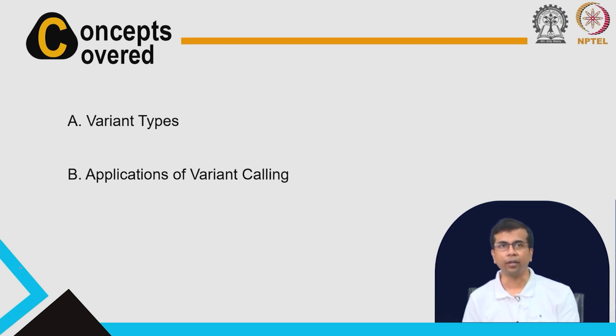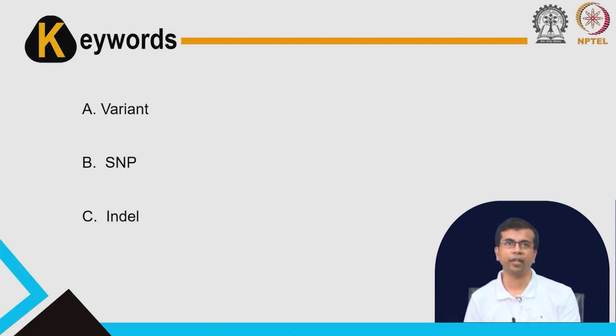Okay, so, let us begin and start with the different variant types. Okay. So, these are the keywords that will come across today. So, variants, SNP and indel.